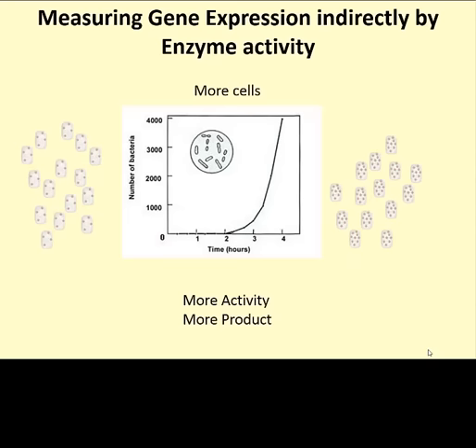For instance, the bacterial growth rate is a function of resources, and so the uninduced cells might grow slower than the induced cells. How can we compare gene expression at different time points or in between 2 different experiments, for instance, induced cells versus non-induced cells? The answer is that we basically need to normalize the total enzyme activity of the sample by estimating cell density.